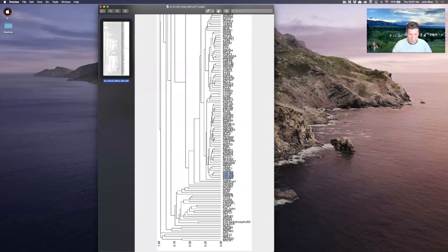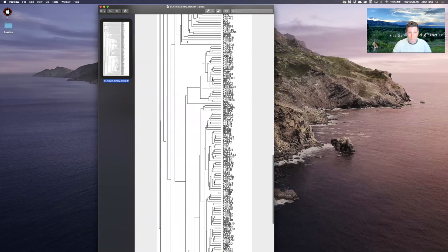Another thing you can sort of pick out quickly is this family of the same type of gene, ZNF here, and all the replicates. Remember, we made consensus peaks from individual biological replicates, but now these are different IPs of different family members, and we still see that they are correlated to each other, and that's good.